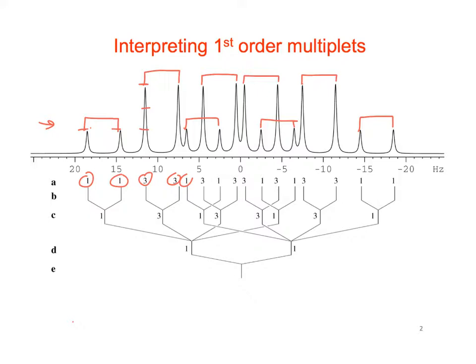Oh, okay. Gotcha. Right, so this is only for a single signal, and it's split multiple times to generate this pattern. So what we're trying to do is figure out how the pattern is generated, and what components generate that pattern.